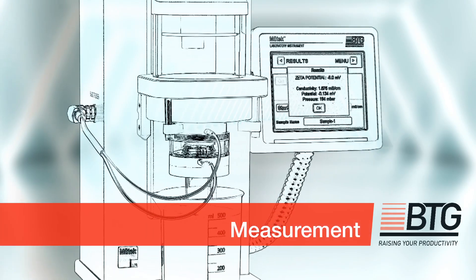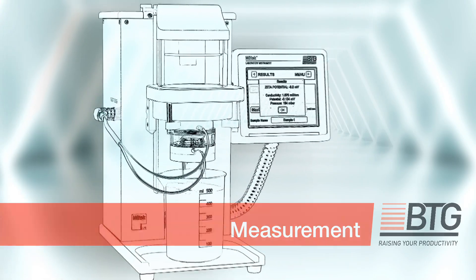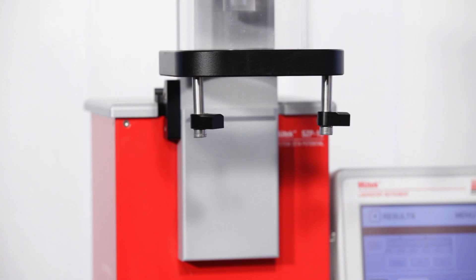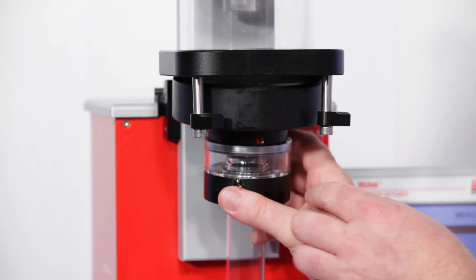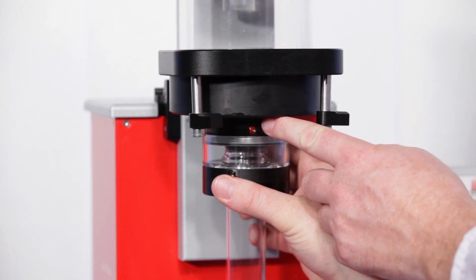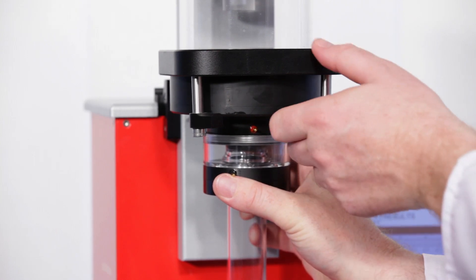Now, it's time to perform our first measurement. Attach the measuring cell to the overflow vessel. To this end, position the cell on the slot in the guiding bar, with the electrodes facing towards you.